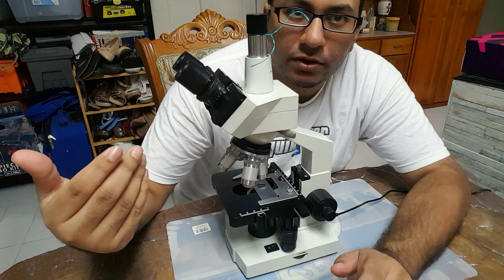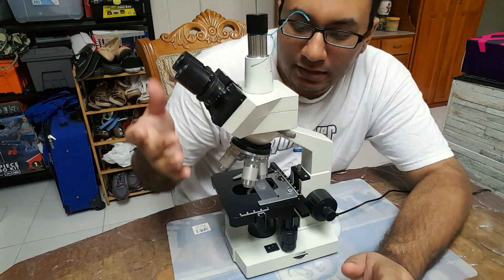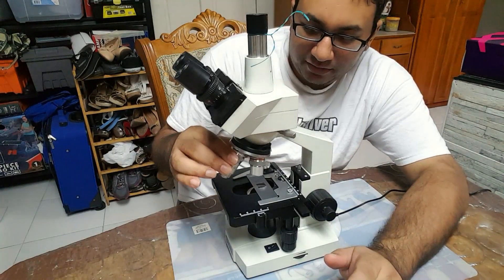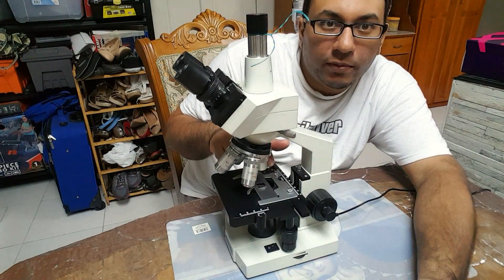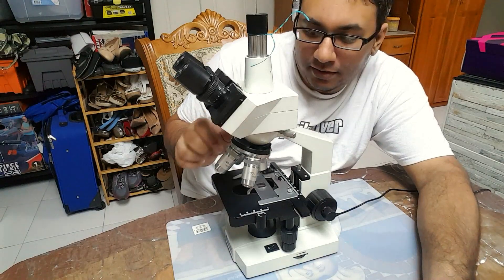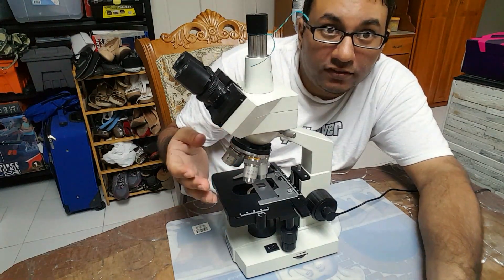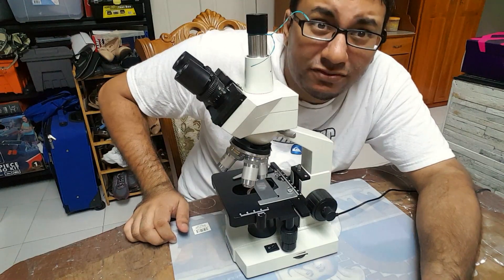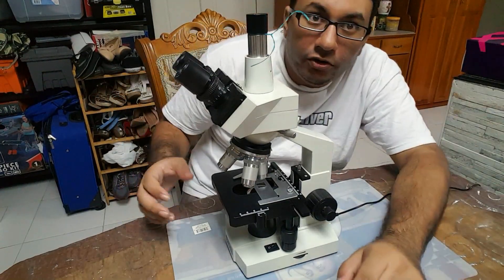Let's start with the eyepieces. You may not be aware that the eyepieces actually have magnification — they're not the only lenses that magnify. There are different magnification powers on the objectives. The smallest one is 4x, then 10x, then 40x, and then 100x. You may be wondering how they claim it can do 2500x — if you could magnify that much you should be able to see blood and so forth.